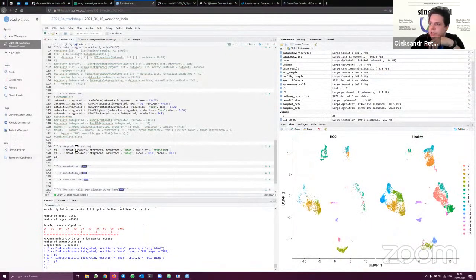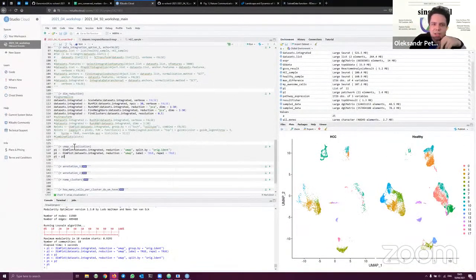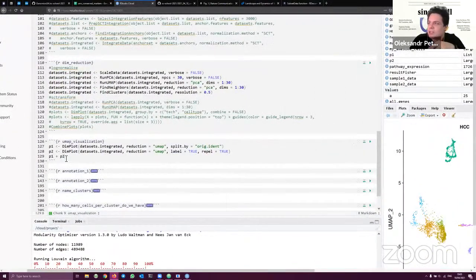And in general, this logic of showing the plots like P1 plus P2, which shows the plots all together close to each other, is taken from the ggplot2 library for R, which is very famous for plotting, meaning that you can technically take all the data sets from Seurat and make any plot you can imagine with ggplot2. However, it may take a lot of time if it's something crazy enough or something nobody has ever done before. So that's how we use these plots.